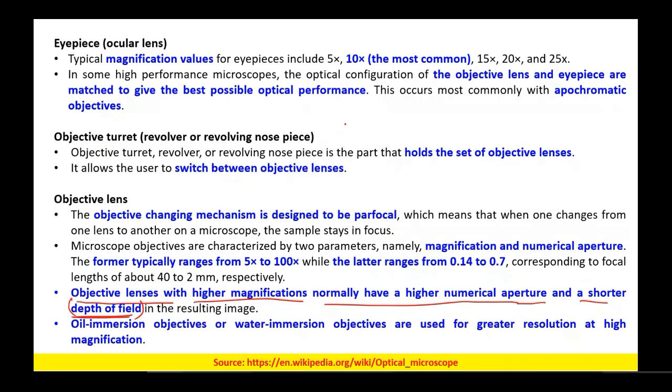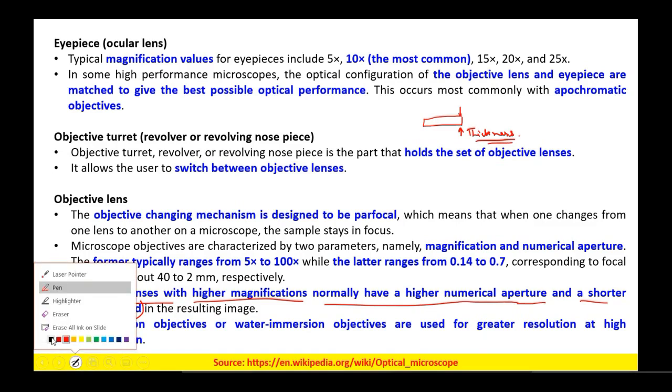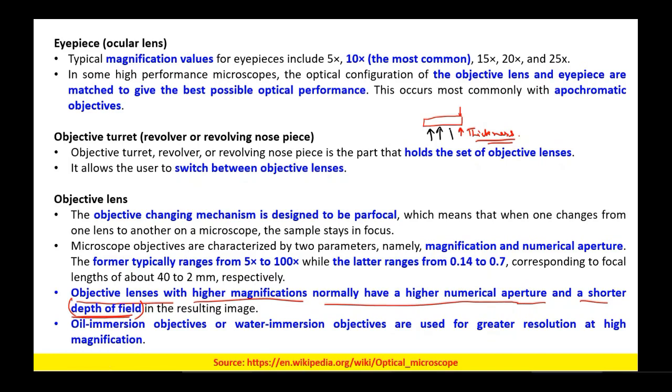Now, when we talk about transmission microscopy, we usually say that we have to make our samples thin. However, however thin you make your sample, it will have a thickness. As we are mostly interested in imaging this thin section, we are capturing all the rays which are coming out of this thin section, and we are using those rays for imaging or for visualization.